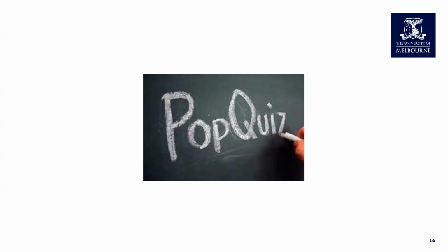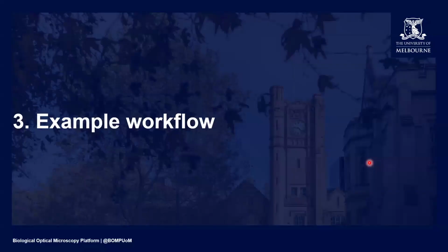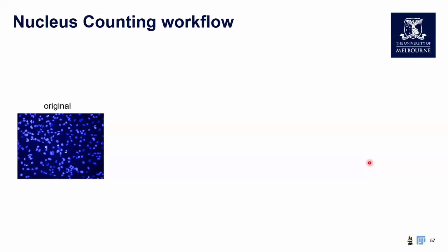Okay, let's move on to the last part of my talk. I'll go through some example workflows to give you an idea of how the actual analysis works, and then discuss the last step of the bioimage analysis workflow, which is reporting.